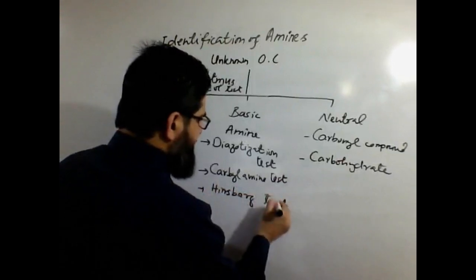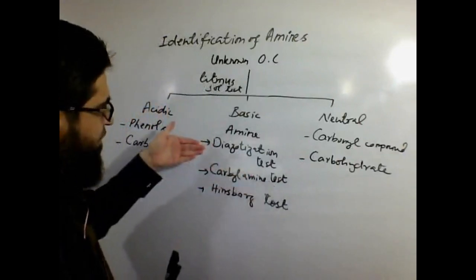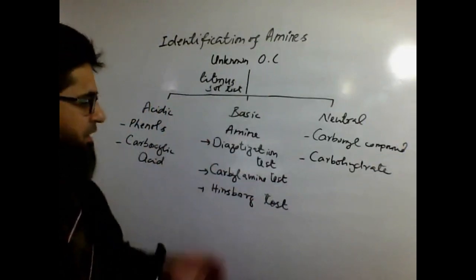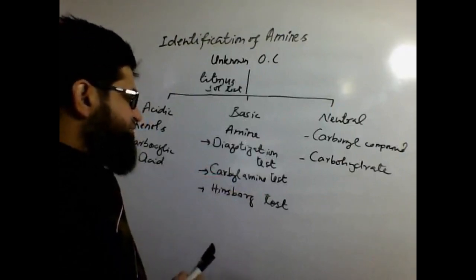So once you know that the given compound is basic in nature, you may apply the diazotization test for confirmation, or you may go for the carbylamine test, or you may move to the Hinsberg test.